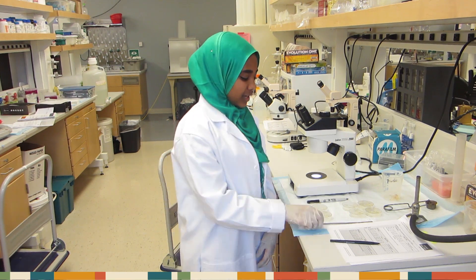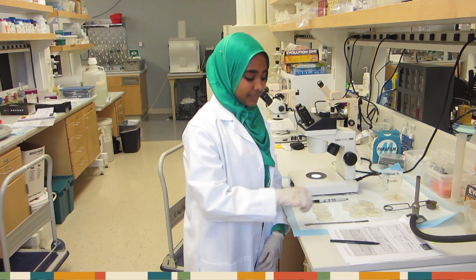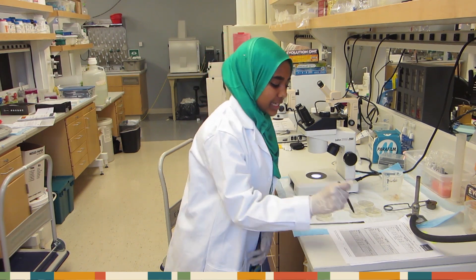Key reminders when chunking worms: always sterilize your spatula, be very careful over the flame, always place your chunks worm-side down, and always write down your data as soon as possible.